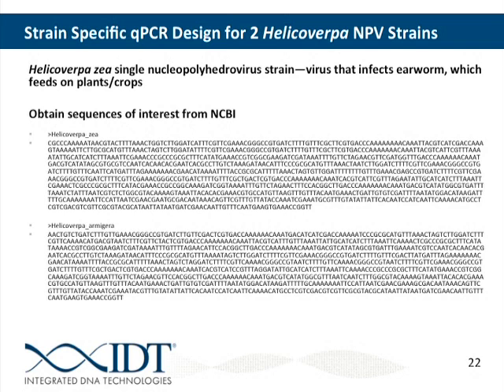And so these viruses infect earworms, which then feed on plants and crops. So hopefully broad applicability to a lot of people in the audience. We've got something that hits plants and viruses and insects. But anyway, these are very similar sequences, and if we want to have an assay that's only going to target either the zea or the armigera virus, we can do so.